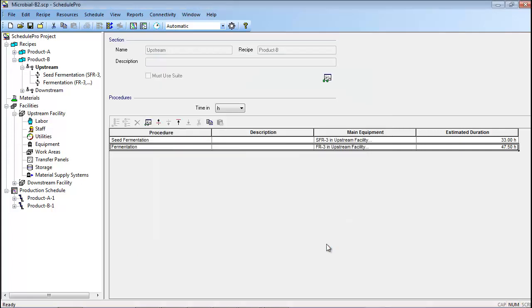Other procedures in the Product B recipe were updated in a similar manner. Although Products A and B generally use different equipment units in this example, some equipment units were shared between the two recipes. These include the centrifuge and the CIP skids. Furthermore, since both recipes used the same centrifuge and CIP skids, the main equipment pool in the centrifuge procedure and the auxiliary equipment specifications related to CIP operations were not changed in either recipe.